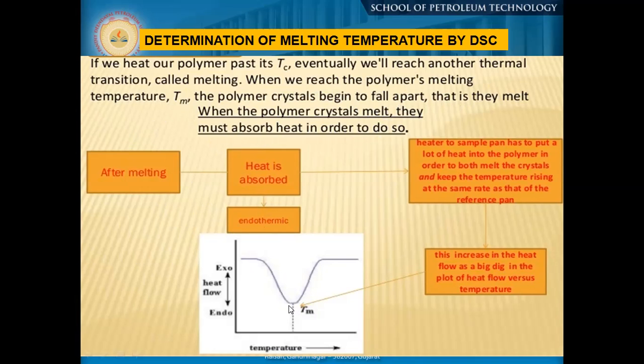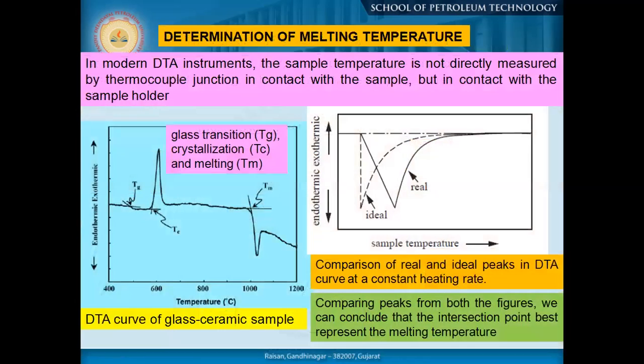So here it is very symmetric, so that's why you can pinpoint a temperature. But this may not be the same for every case, for so many reasons. I'll just show you one graph here. So if you see, here how would we judge where the actual temperature is? Here you can see we are getting a different graph and the slope is not properly fixed.